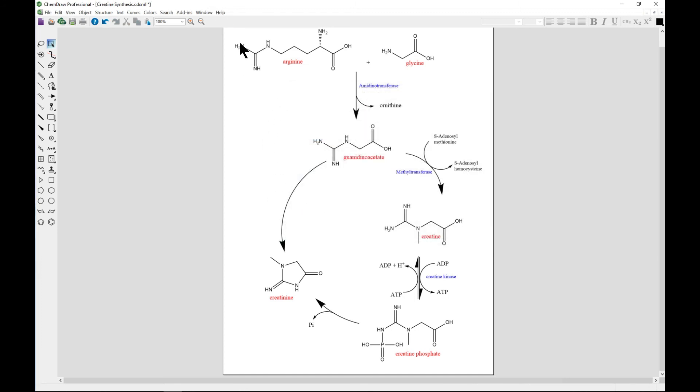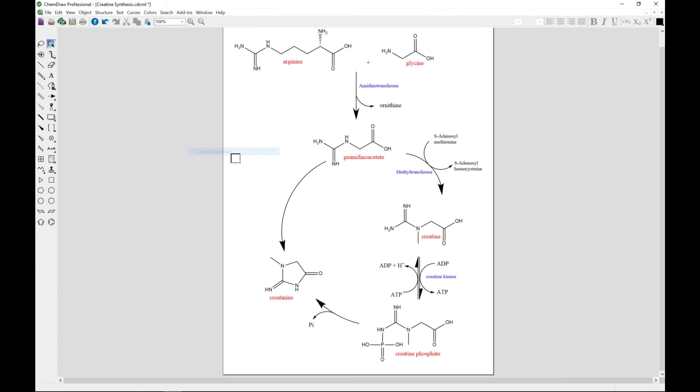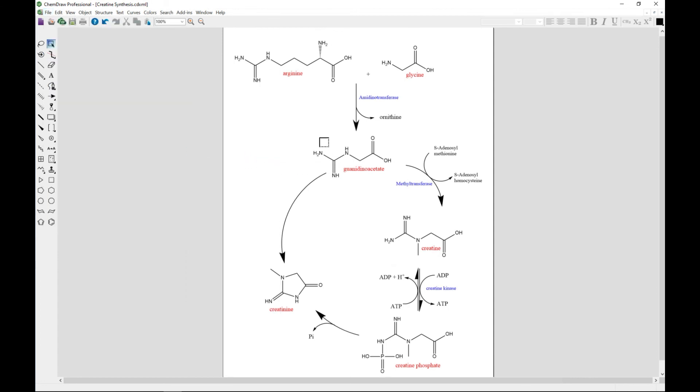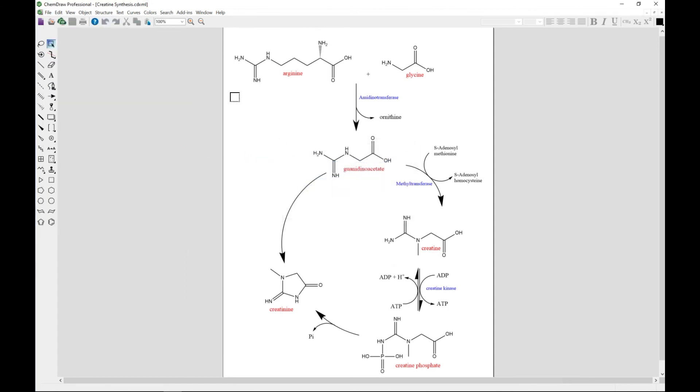Mind you, I chose this from Creatine Synthesis. Let's go to Proceed. When you come, you can select all of it. You can choose the marquee tool or you can go to Select and Select All.